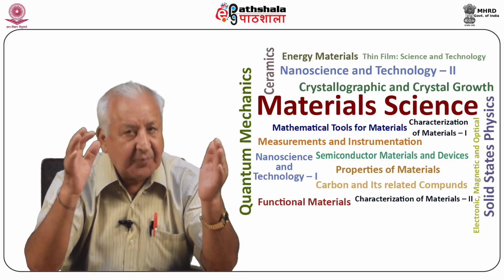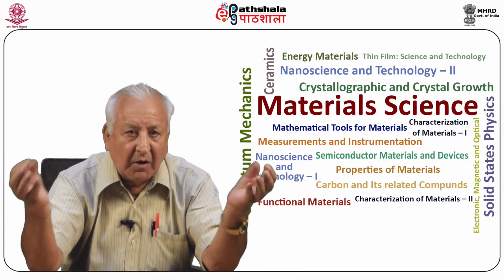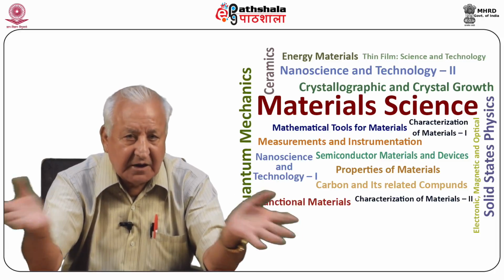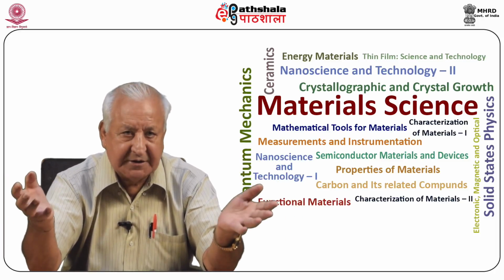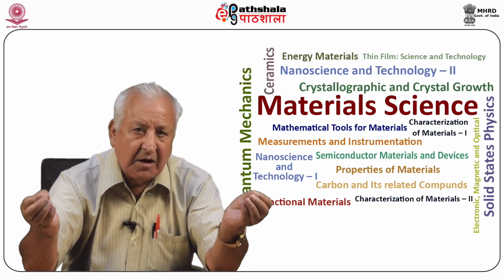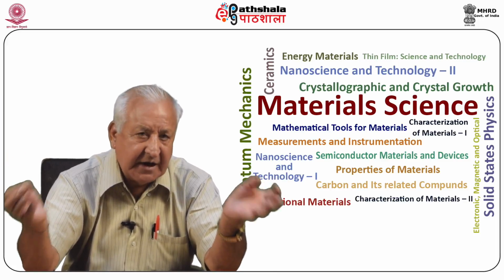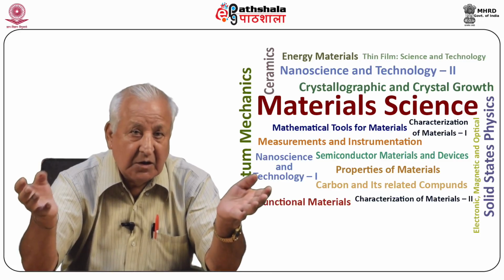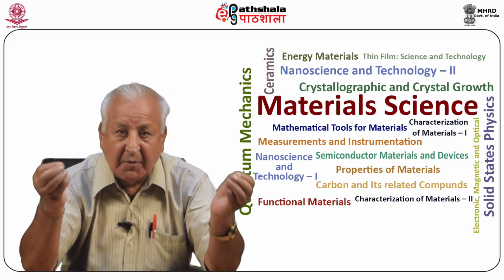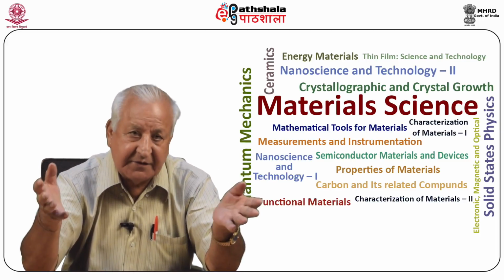Further, reflections are possible not only from the different sets of planes but also in the orders for each set. The powder crystal method is the only technique which is readily available to all crystalline solids. The diffraction data, which depend on the lattice parameters, are unique for a given material and therefore can be used for its identification. To identify a human being, we make use of his fingerprints. In the same way, diffraction data of powdered crystalline samples are unique and become a means of their identification.